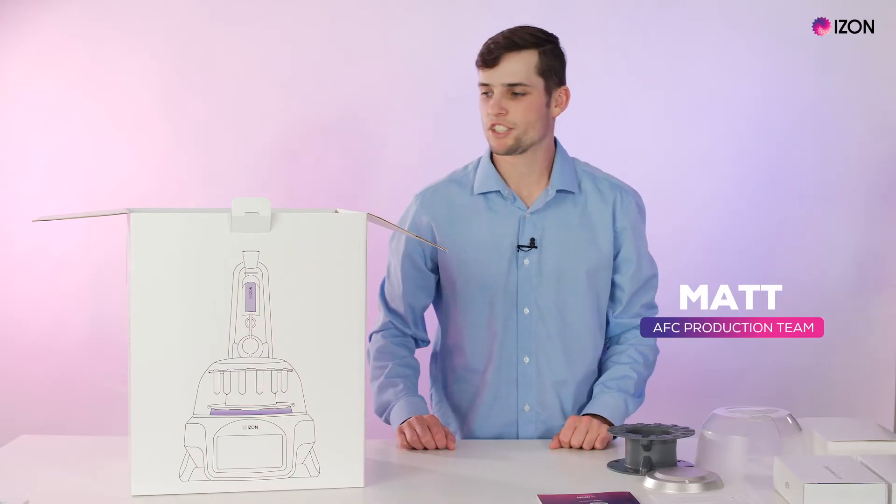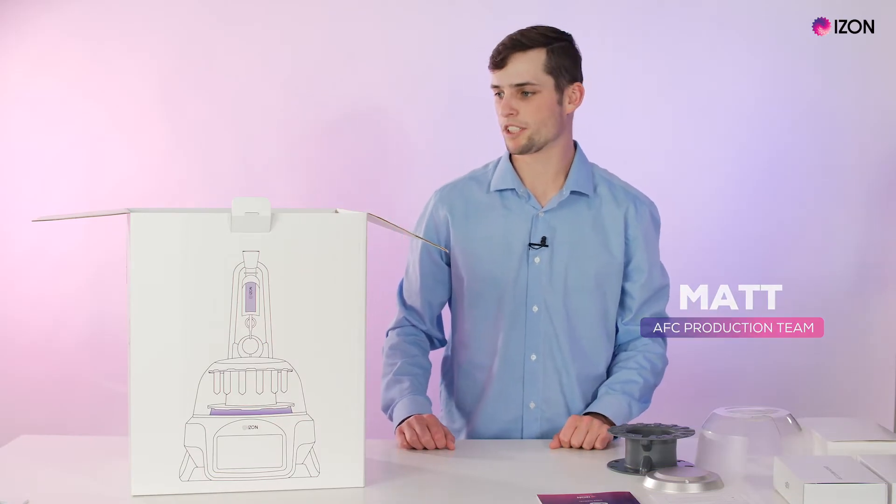Hi, I'm Matt, I'm part of the AFC production team and I'm here to show you unboxing the AFC and setting it up.